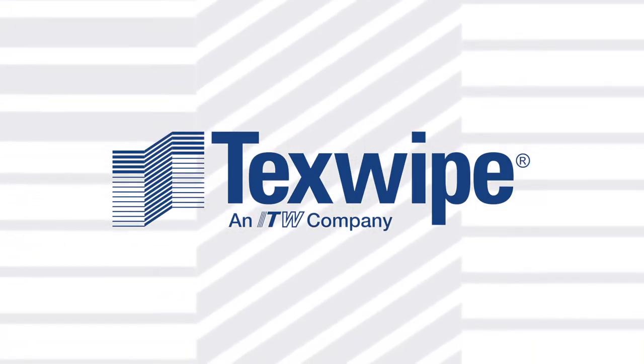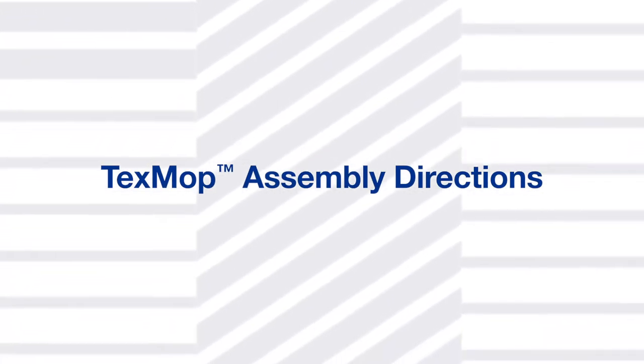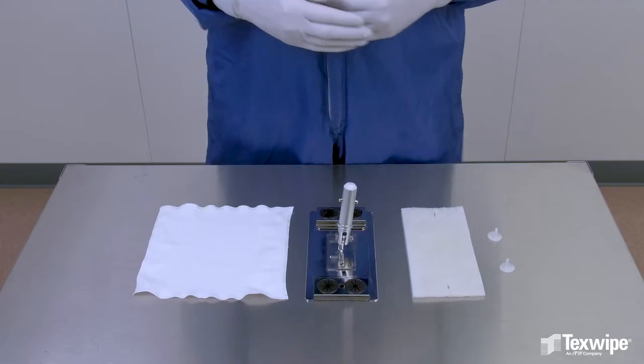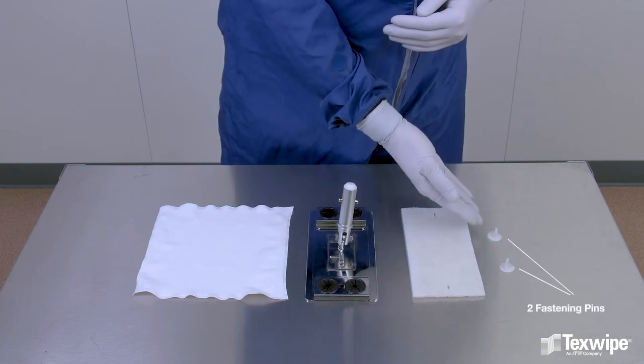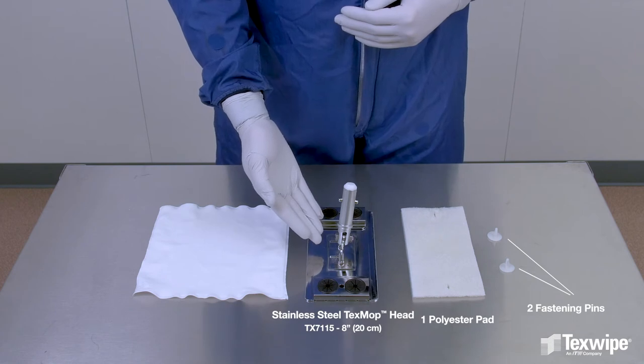TexSwipe presents TexMop assembly directions. The TexMop consists of two fastening pins, one polyester pad, and a stainless steel TexMop head.